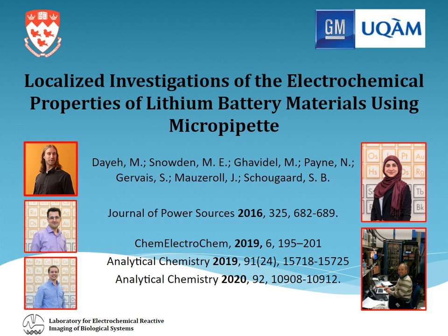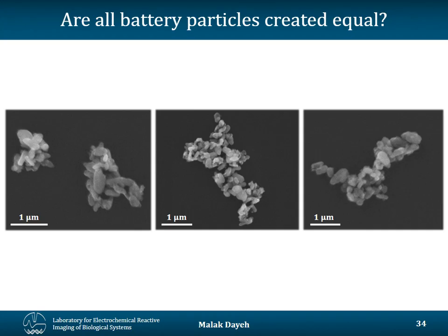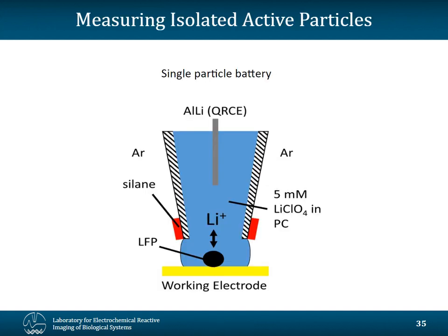You can apply it to entire cathode or anode films. You can evaluate the effect of film porosity using SECM, but you can also answer questions like, are all battery particles created equal? And that's because of the high resolution capabilities of the method.